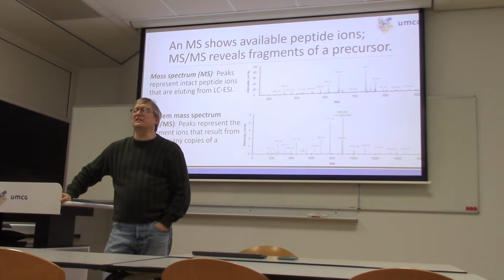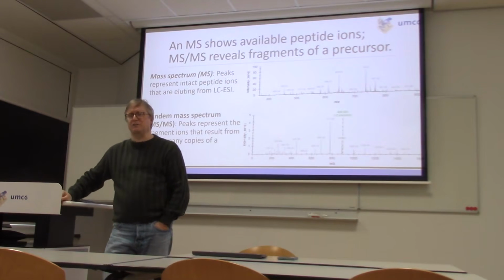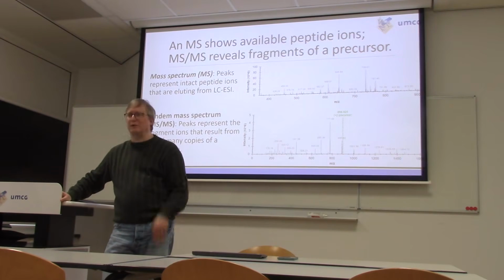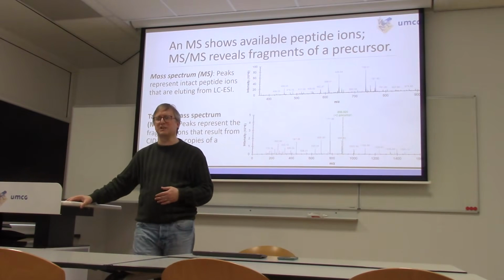I think what I would say is that there are plenty of situations that can only really be addressed through MALDI. There are plenty of situations that can really only be addressed through liquid chromatography, ESI. If you have a liquid flow of peptides, then it's almost always going to be electrospray we talk about. If you were trying to identify a single spot off of a gel, then MALDI is going to be completely ideal for the purpose, because you don't need to waste an hour and a half on a gel spot to know what proteins are there. So they represent very different uses of the instruments, essentially.